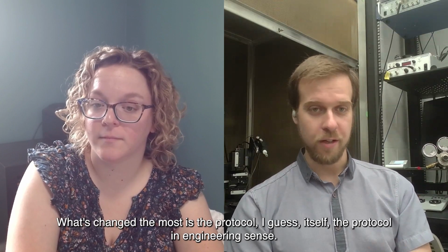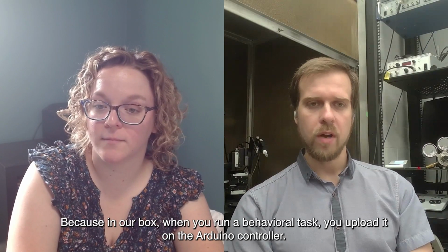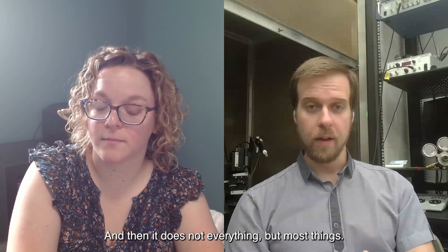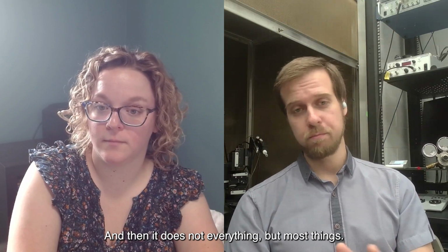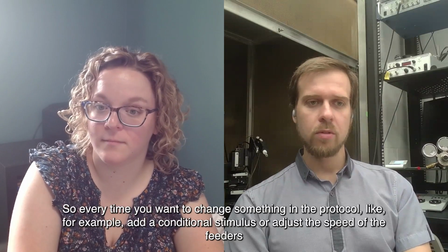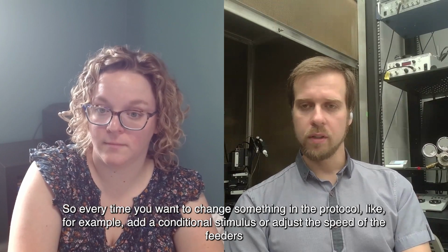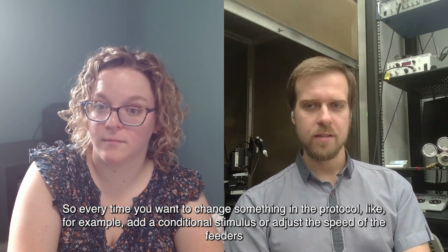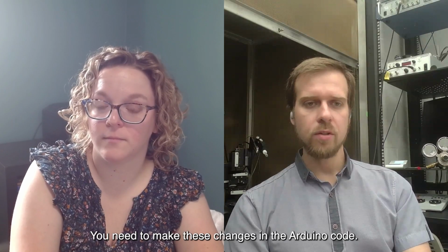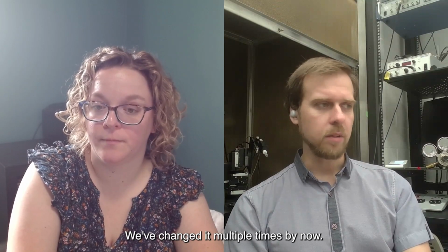What was changed the most is the protocol itself, the protocol in the engineering sense, because in our box, when you run a behavioral task, you upload it on the Arduino controller, and then it does not everything, but most things. So every time you want to change something in the protocol, like add a conditional stimulus, or adjust the speed of the feeder, or add something else, you need to make these changes in the Arduino code. We've changed it multiple times.